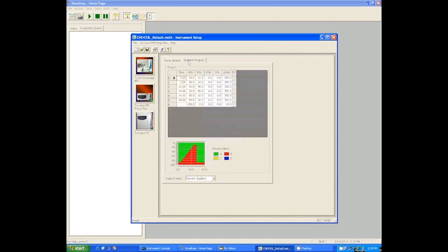This is set up so that you program what percent A and percent B and the flow rate you want at each point in time. In the current program, we start at 90 percent A, 10 percent B, which is pretty typical at zero minutes.